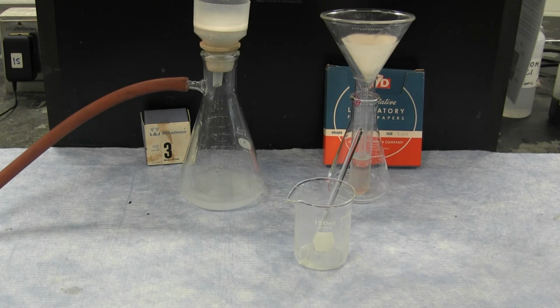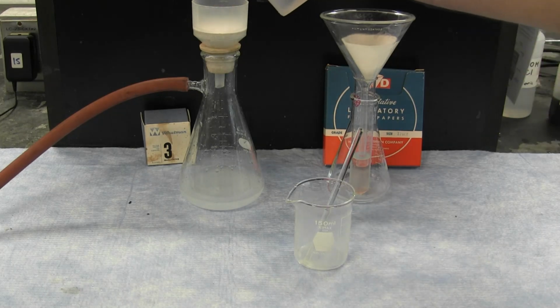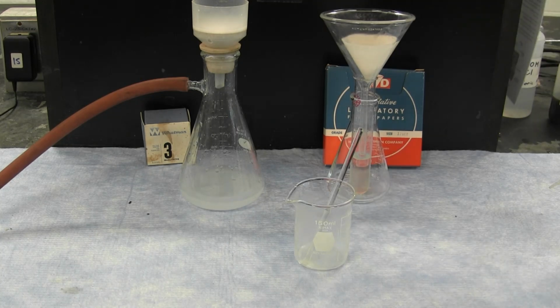As with the gravity filtration, once the solution is passed all the way through and the precipitate is remaining on top of the filter paper, it can then still be washed to make sure that the precipitate is clean.